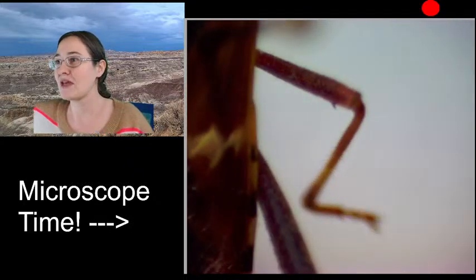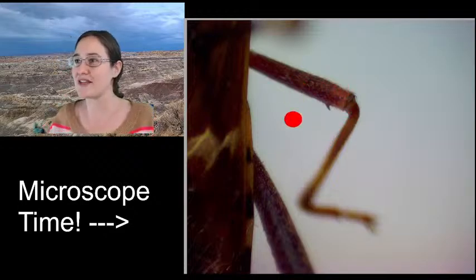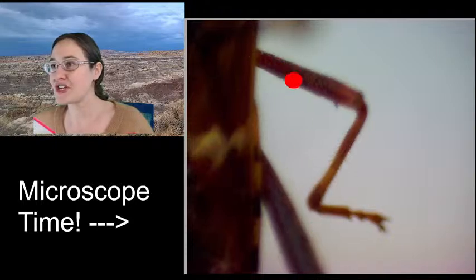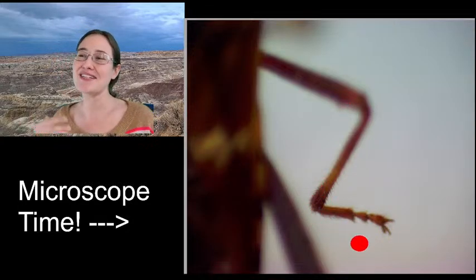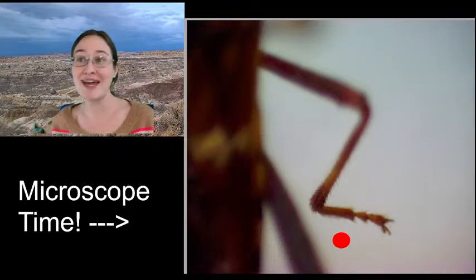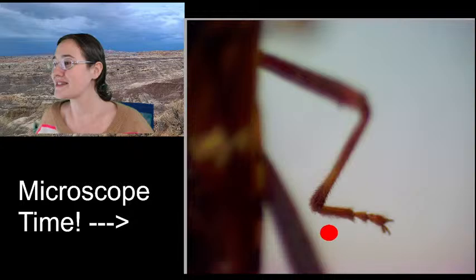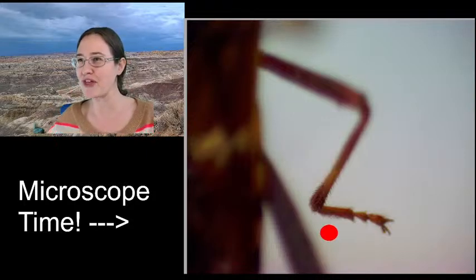All right, so actually, you can see on the middle leg that the femoral spine is a little bit more obvious on this guy. So he's got femoral spines on both his front and his middle legs. So it's femur, and then tibia, like between the knee and the ankle, we have a tibia. They've got a tibia. And then it does get a little weird when you get down to the little toe segments. But if you think about it, our toes are called metatarsals, right? And insects just get tarsals, or tarsi. The pads help them climb slick surfaces. So do the pads have like little suction cup hairs on the bottom of them?